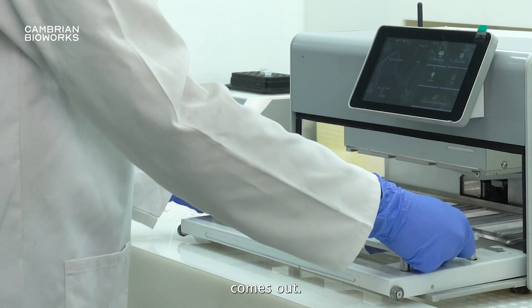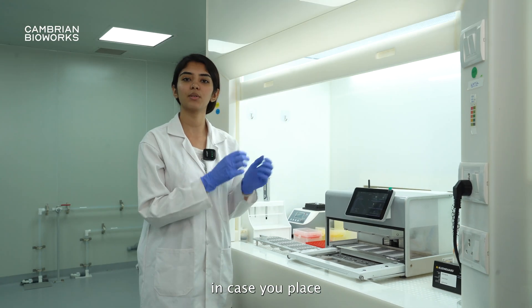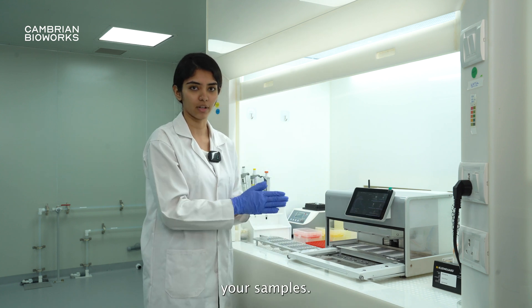This workstation comes out. You can keep it in a biosafety cabinet such as this and prep all of your samples inside. In case you've placed Manta in a separate part of the lab, you can still remove this and place it inside the biosafety cabinet to prep all of your samples.